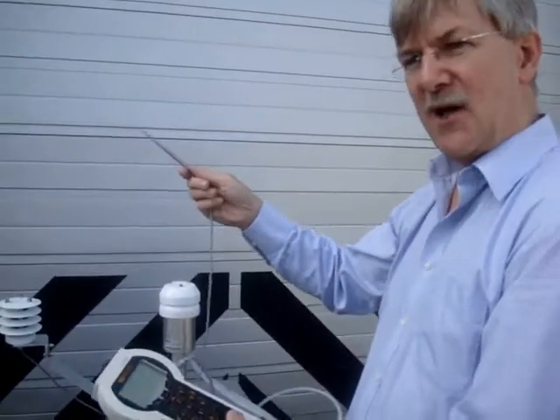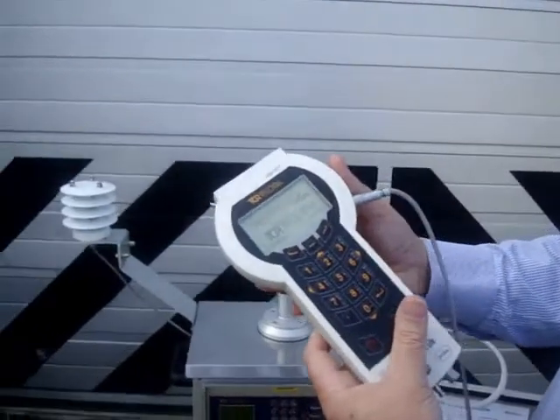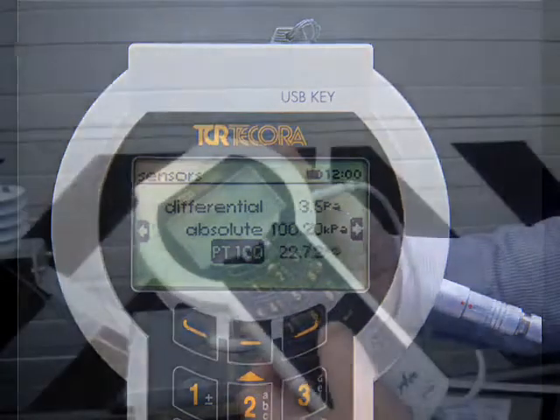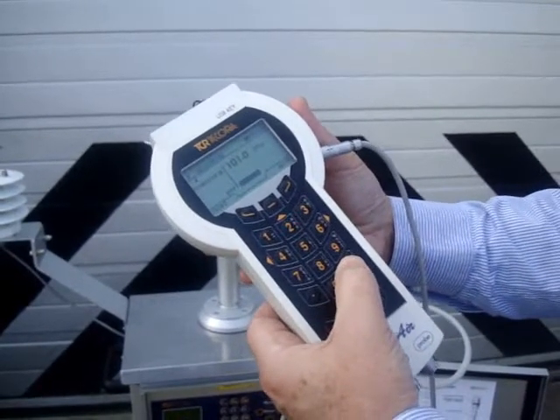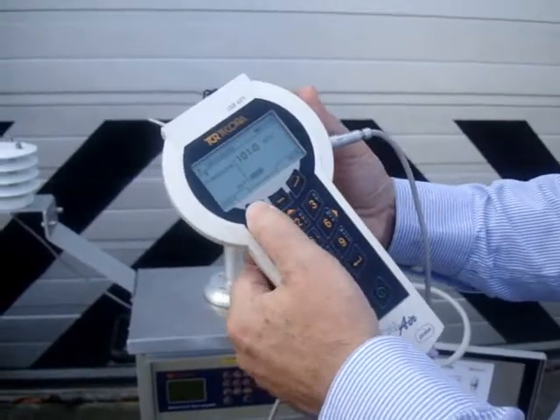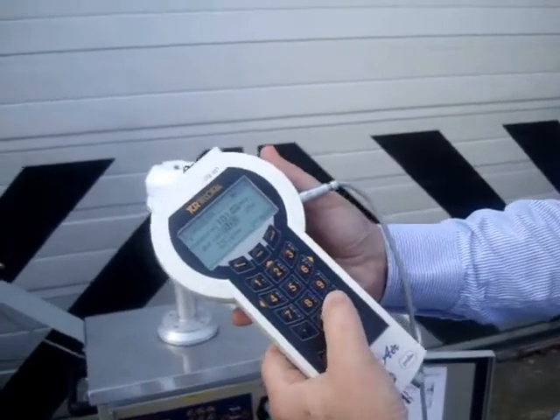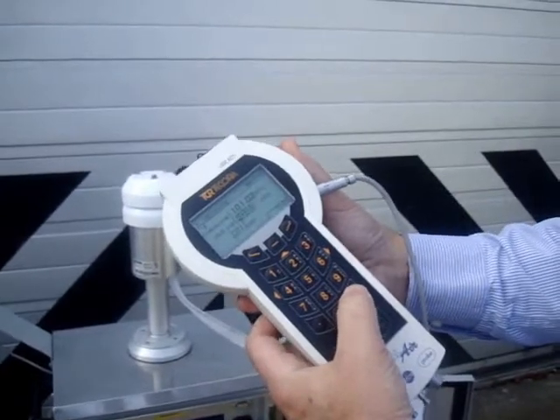In this case, the flow sensor has been removed and an external temperature sensor is fitted in its place. So now when the device is turned on, it recognises that there is no flow sensor fitted, but there is a temperature and ambient pressure sensor incorporated. To log and compare values for absolute temperature, we go through essentially the same sequence as for flow measurement: identify the device under test, initiate a measurement sequence, display the current ambient pressure recorded by the air sampler, and enter it into the FlowCal.